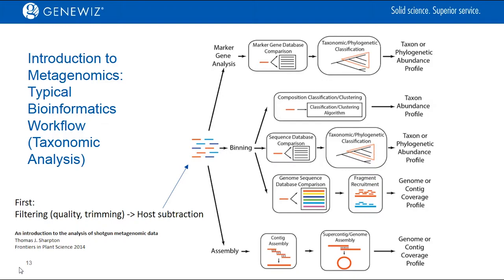Now, if we look at the middle workflow, this is the best general workflow to follow for doing taxonomic classification. The binning step is attempting to classify reads to a given genome, and depending on how you are doing your alignment to a sequence database, it can be very computationally expensive. I use a biomarker-based lowest common ancestor classification method, which is going to be very fast to align to the sequence database with excellent specificity. Really, it has a great balance of speed and accuracy. However, it requires loading the database into memory to achieve this, so you need proper computational power.